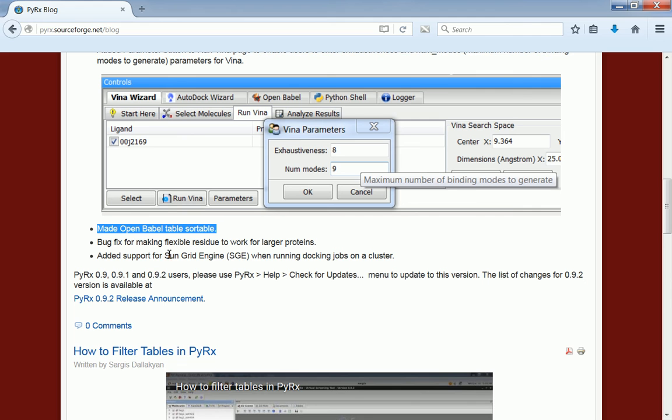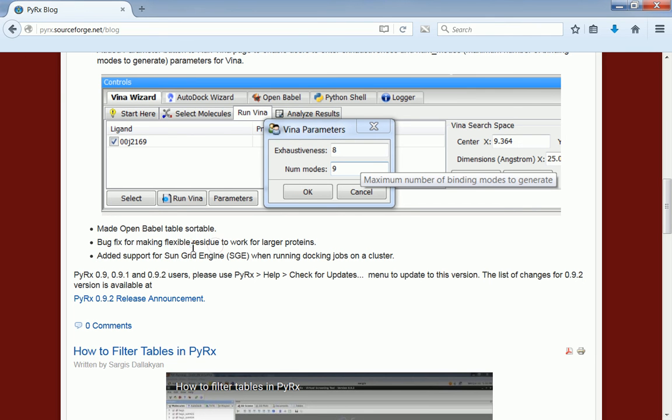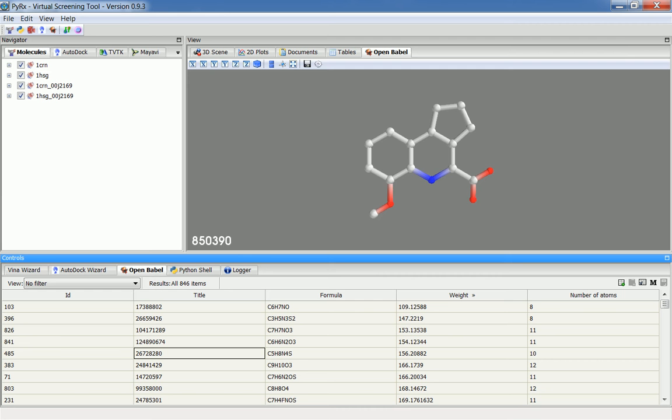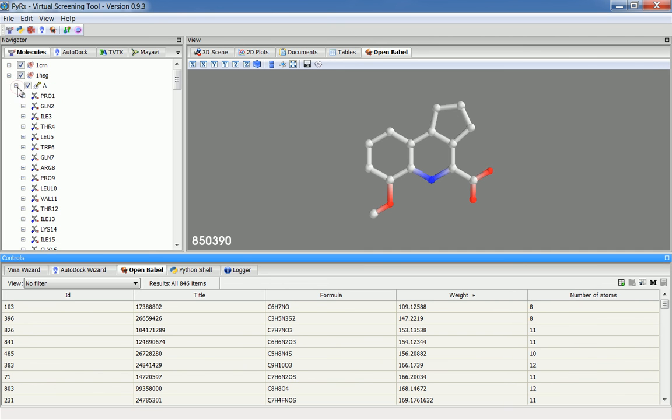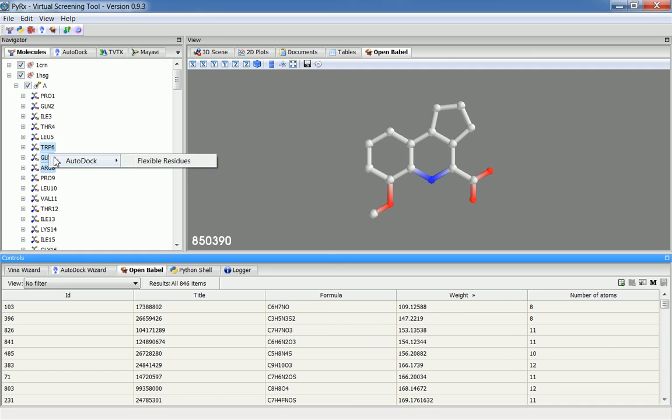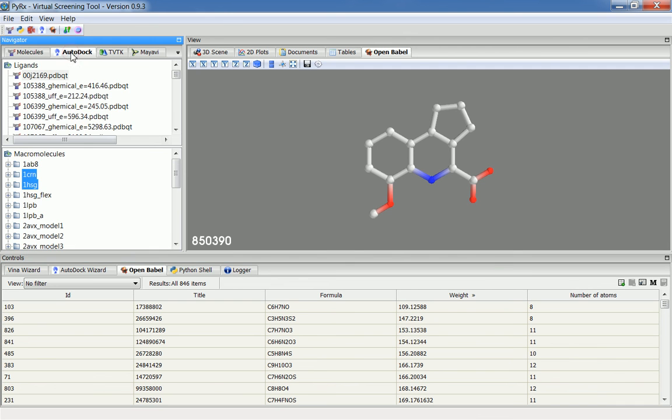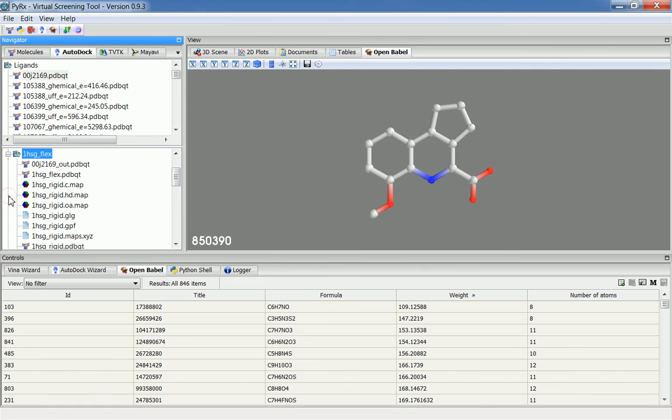The next feature is a bug fix. When making flexible residue, now you can work with larger protein. The problem with the previous release of PyRx, you select one of these macromolecules and go select some of the residues. Using shift or control key, you can select multiple residues at once. When you click AutoDock, make flexible residue, that creates an underscore flex folder where it stores the rigid part.